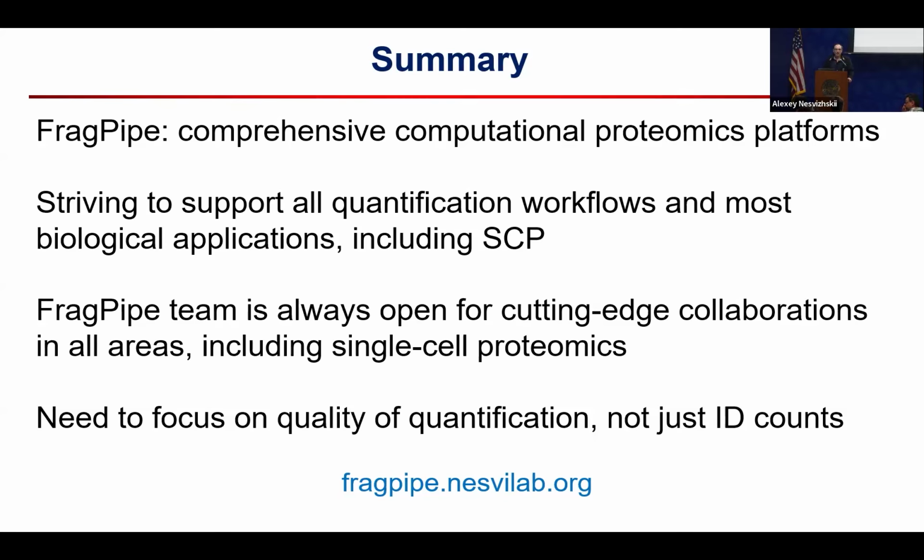Is that possible? Yeah, I think everything is possible. We're going through a lot of these optimization experiments constantly. For example, in MSFragger, we do de-isotoping first for high resolution data. We first de-isotope fragments and convert them to singly charged fragments, and we actually search the data only with the de-isotoped, decharged fragments. So we're not searching 2+, 3+ fragments. We try to reduce the search space. In a sense, we're matching fewer fragments, but higher quality fragments, and it tends to help us.